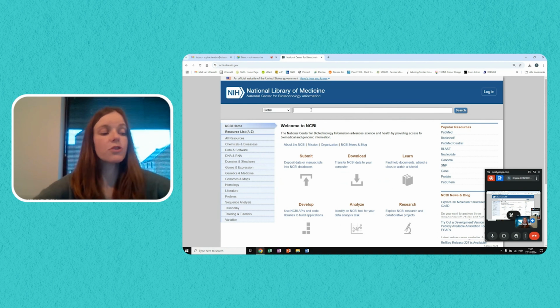And then in this search box, you can search for your gene of interest.